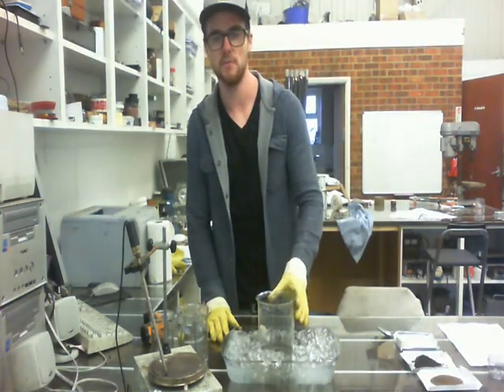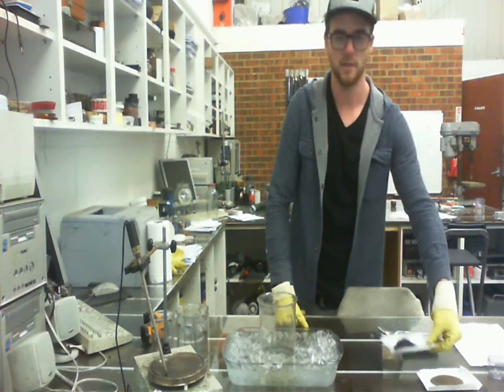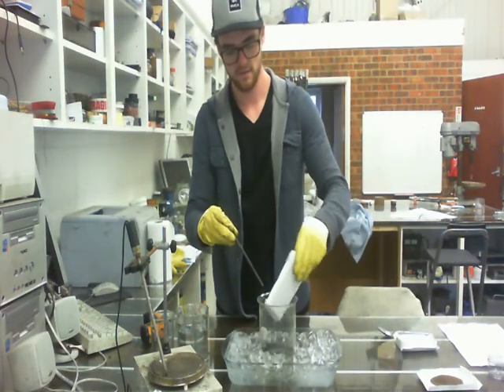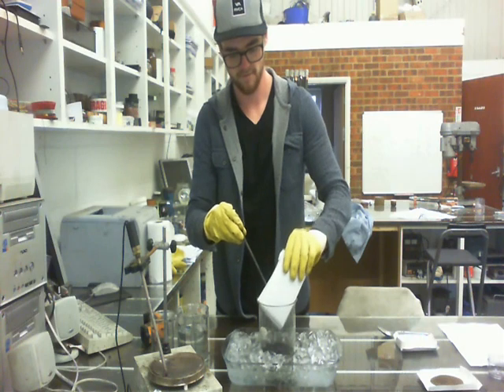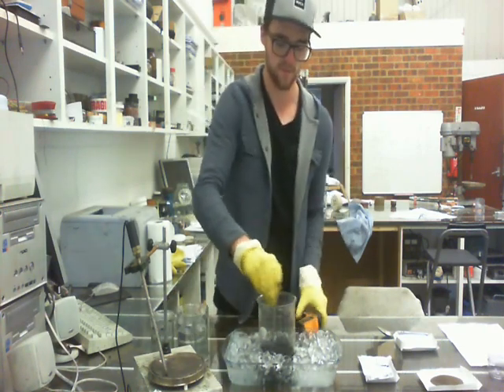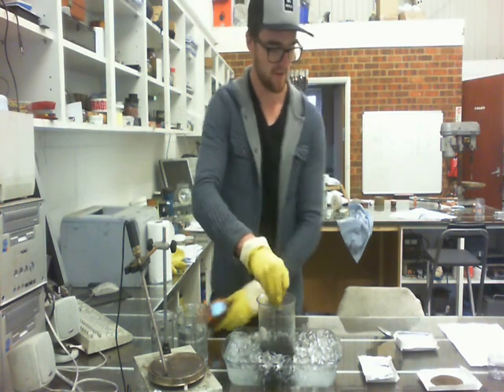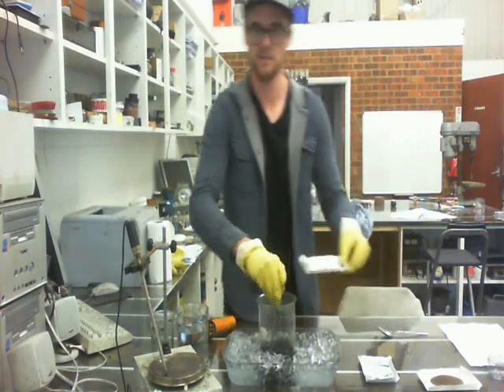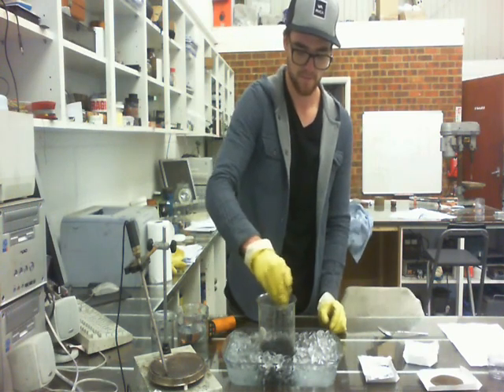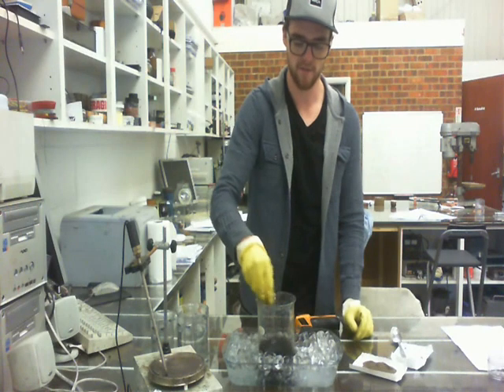The amounts we're going to be using: we've got the sulfuric acid here — 230 milliliters — and it's been cooling for about half an hour to zero degrees. We're going to add 10 grams of the graphite and stir it. We're going to check the temperature again because we want it to remain under 20 degrees. Then we're going to add 5 grams of the sodium nitrate.